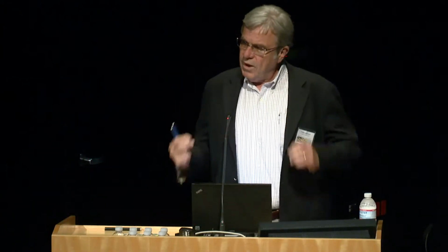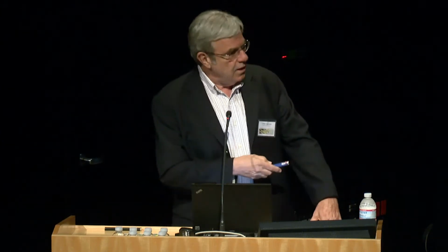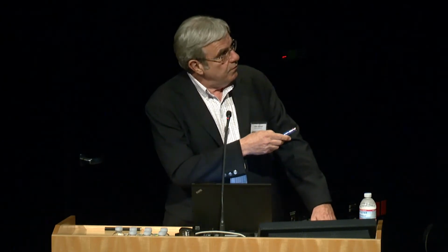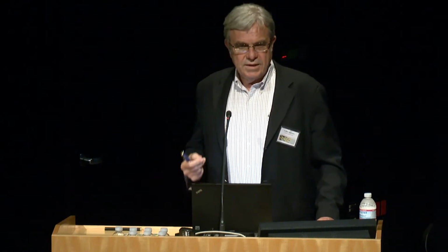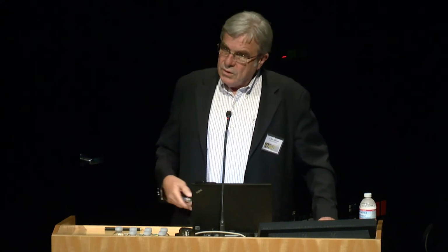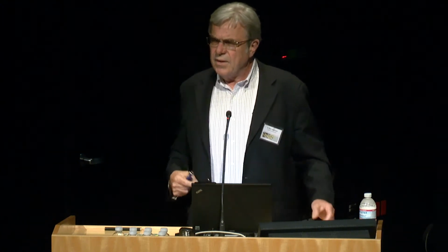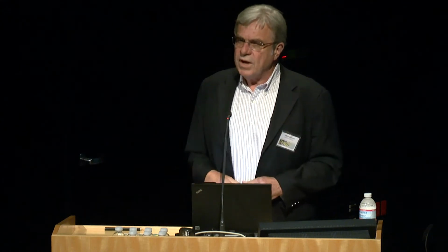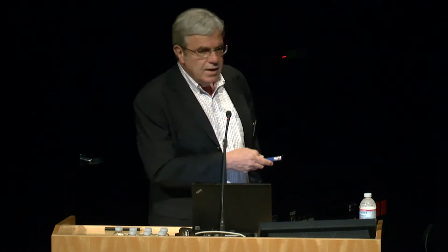One of the big problems of this technique is that the sampling's pretty slow. So if you flow through here, say at 1 microliter per minute, and the minimum volume that you can work with to do this kind of analysis is a microliter, you're going to have to sample on the minute time scale. And as you probably realize, things in the brain occur much faster than that. So you'd like a faster method.